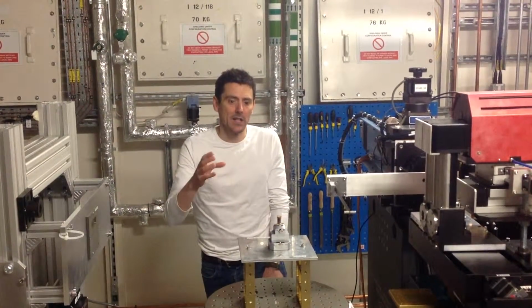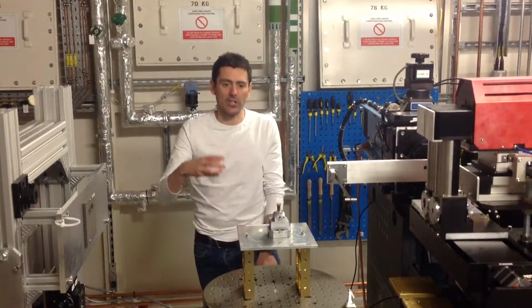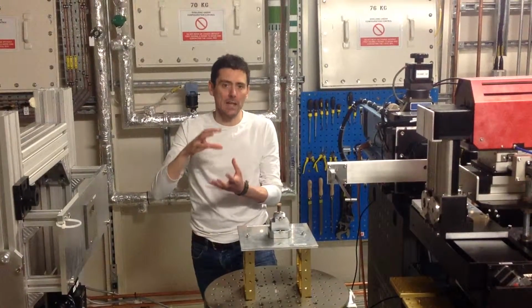And we've had 10 samples that we've scanned with the X-ray beam, and we're going to study those in detail and try to pick apart this understanding of where the carbon is within the soil.